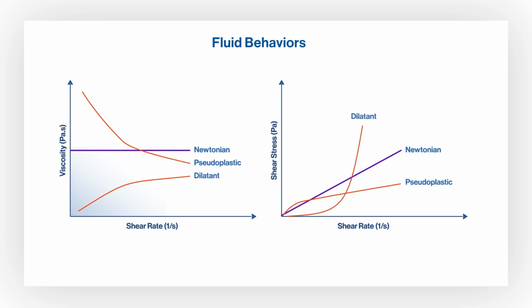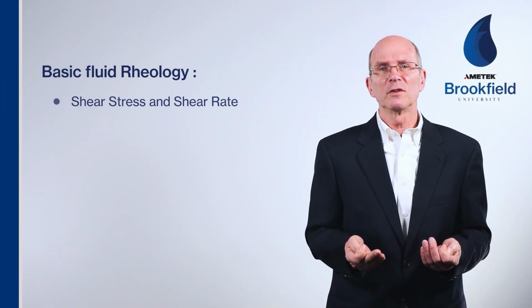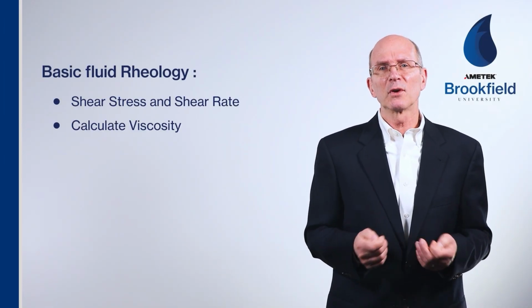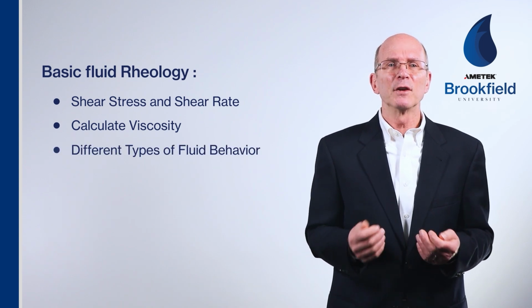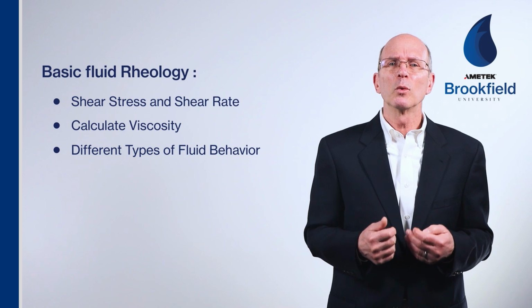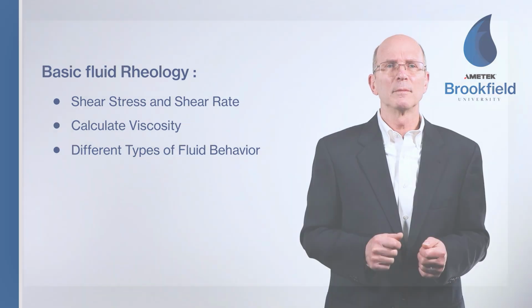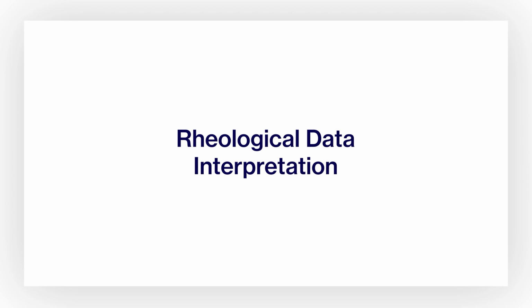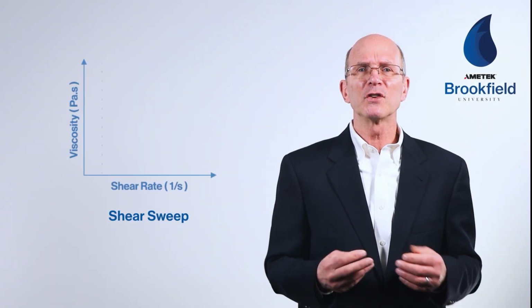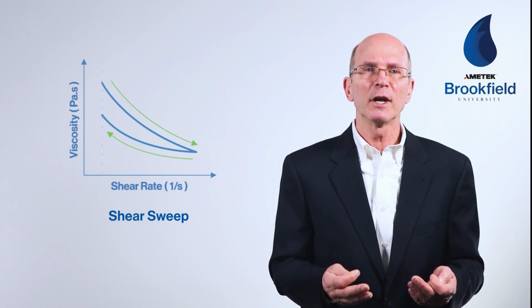Now you understand the basics of fluid rheology, including what is the shear stress and shear rate, how to calculate viscosity, and the different types of fluid behavior. With these principles in mind, we'll look at how to interpret data from various test methods. To define a fluid's rheological property, a shear sweep can be performed, profiling the rheological behavior of your sample.